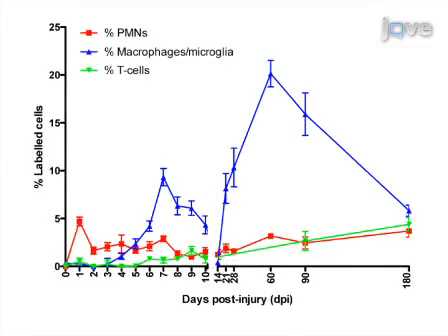Ultimately, results show the removal of lipid myelin debris enhances the quantitative detection of cellular inflammation in the injured spinal cord tissue using flow cytometric analysis. The main advantage of this technique over the traditional cell dissociation method is that you can effectively separate and remove myelin debris from cells and thereby facilitate the quantitative assessment of cellular inflammation in the injured spinal cord tissue using flow cytometric analysis.